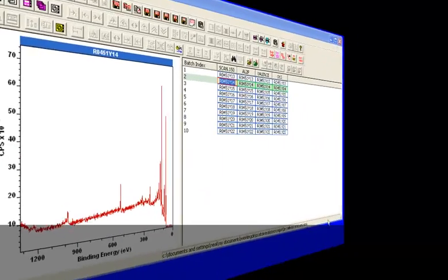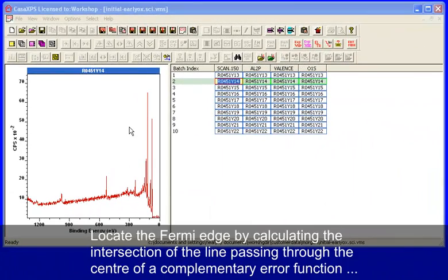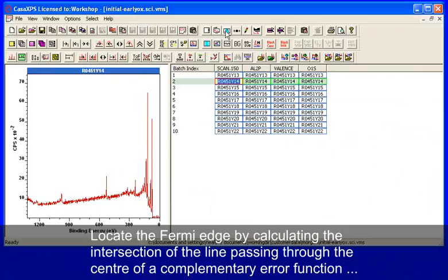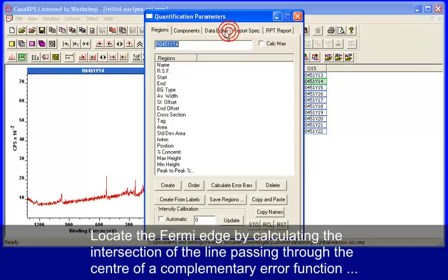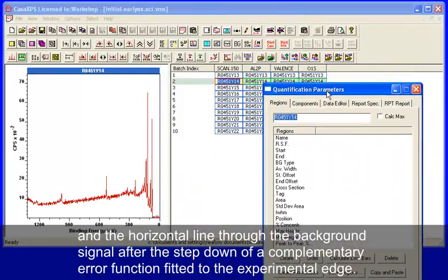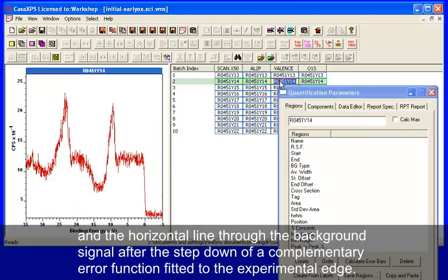We've got a step down in this case and the idea is to use a complementary error function and locate the position of the Fermi edge based on two lines that intersect.